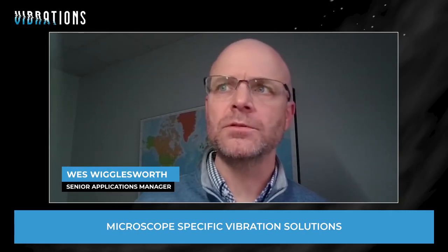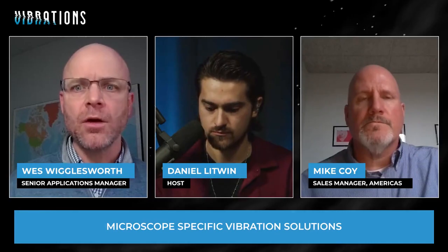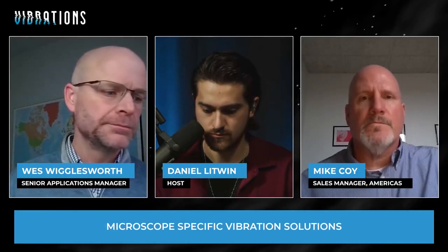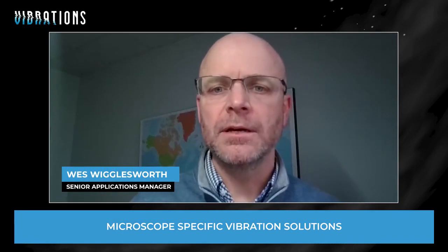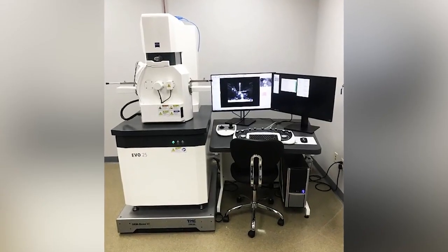So scanning electron microscopes, transmission electron microscopes. These are imaging tools that are resolving down to a nanometer. Advanced resolution of these devices really demands a much more quiet environment, and at all frequencies, down to very, very low frequencies. So an active vibration control system is not just suitable, but required for those type of instruments.